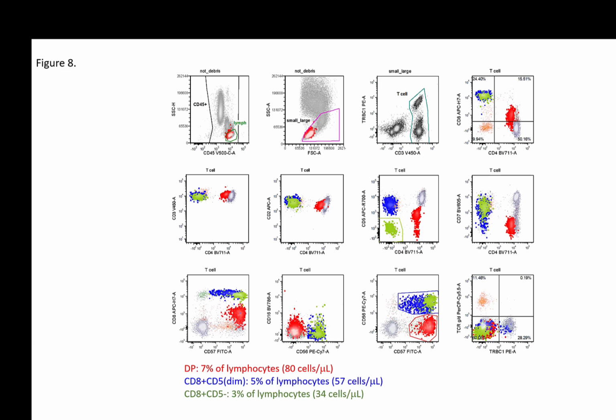So in cases like this, I actually don't put this as an abnormal population in the bottom line because, as we know, pathologists are new to TCUS, and so are oncologists. So again, trying to reduce harm. In these kinds of cases, we put it in the comment that we say, yes, we do see multiple small populations with more of an LGL phenotype. It is an oligoclonal pattern and is favored to be reactive. Not everybody may have the clinical correlations to push it all the way in, but you can favor it. And we should be moving towards that instead of just reporting out an abnormal population.